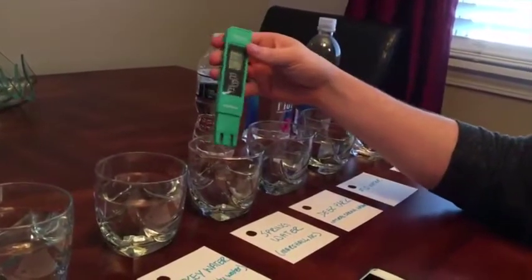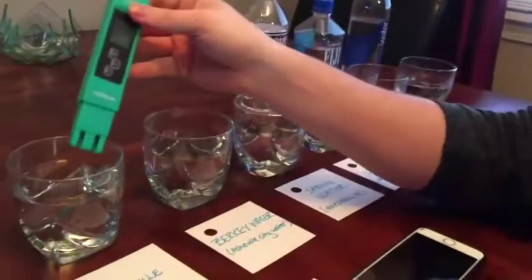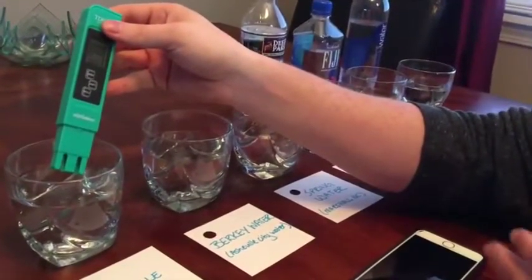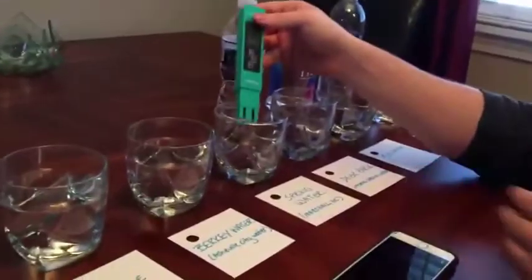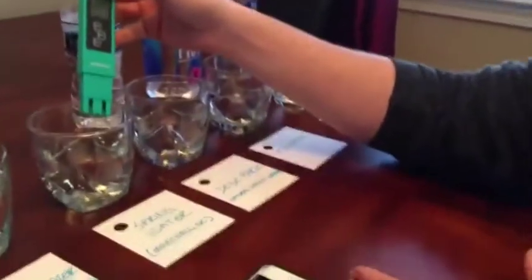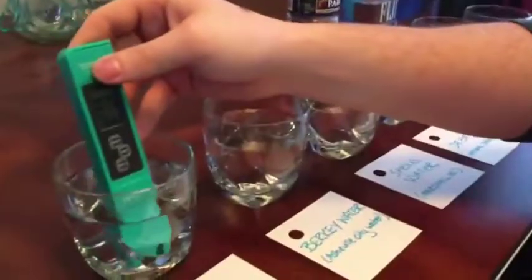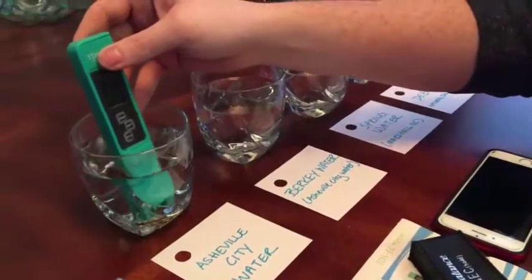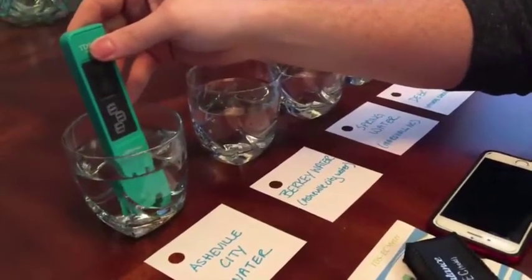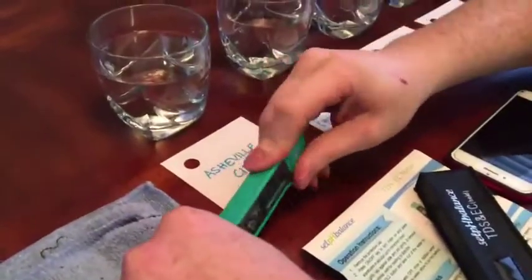So clean water is going to be as close as you can get to 0, and a 30 here, it's not ideal. Not trying to say it's unsafe, but if you can get something better, choose the better option. A really great example of why this works for us is that we have fish. Fish are extremely sensitive to dissolved solids, and we can't use this water for the fish, even after we dechlorinate it. That just tells us it's not a good fish water source. So using the spring water, we'll have a great source as well.